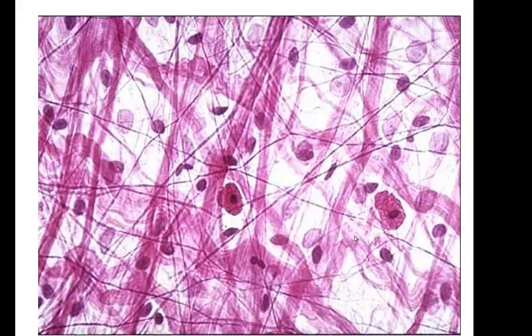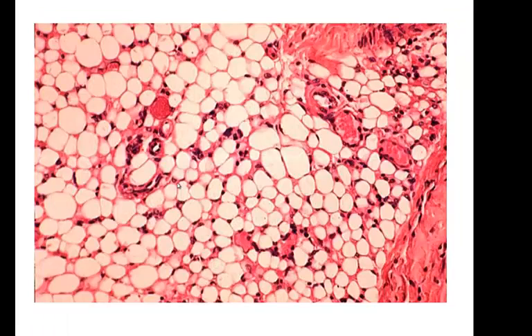We have a loose arrangement of fibers, and I want you to compare this tissue type with nervous tissue, because areolar connective tissue and nervous tissue, they're the two types that you might mix up. But when you compare them side by side, you'll see that they don't look anything alike. Nervous tissue has neurons, areolar connective tissue does not. So those are our two slides of areolar connective tissue.